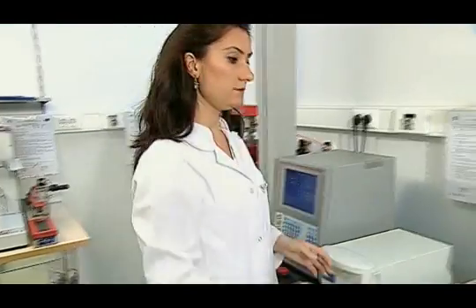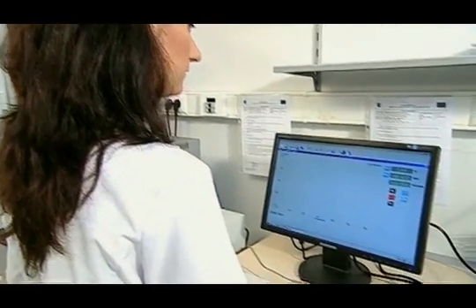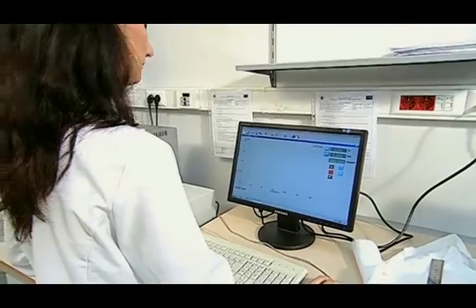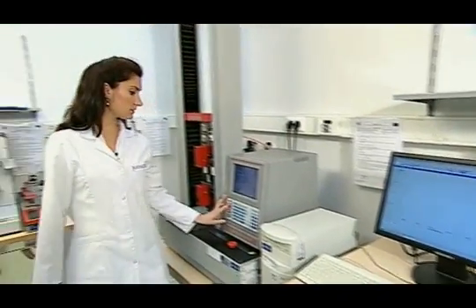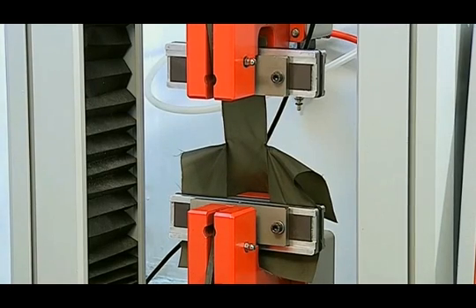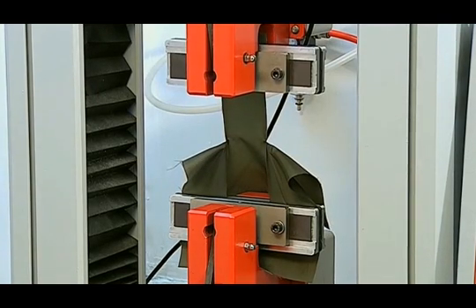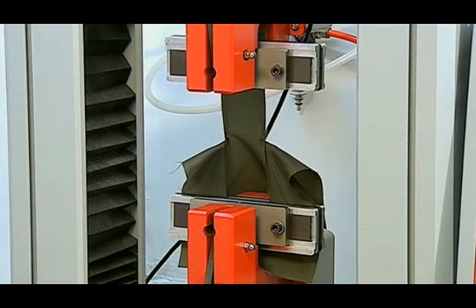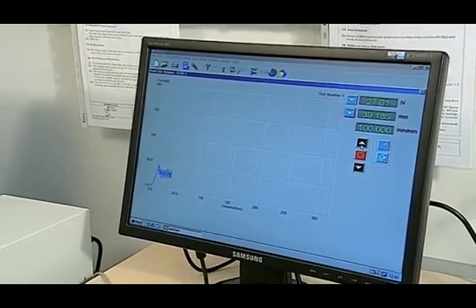Then, the strength and elongation values on the computer screen are reset to zero, and the OK button at the top is pushed to start the test. Peaks appear on a computer screen, and the upper jaw moves at a fixed speed.